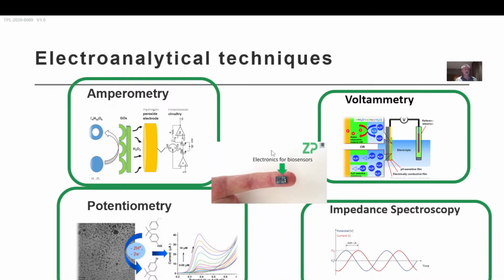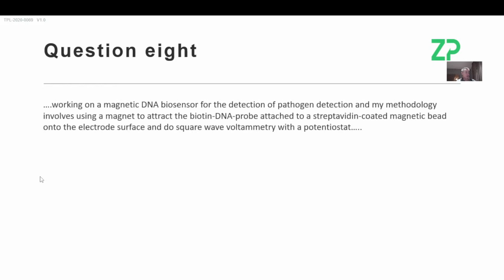All of these methods can be applied using very small potentiostats these days. This is one of our single-purpose biosensor circuits from Zimmer and Peacock. I will move forward a little quicker, and my apologies for starting this webinar early today.